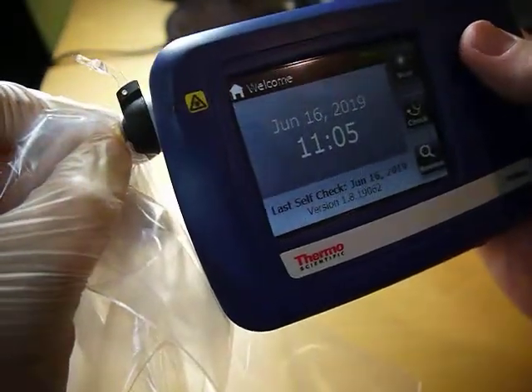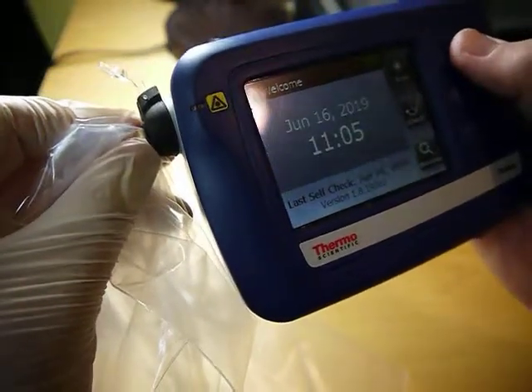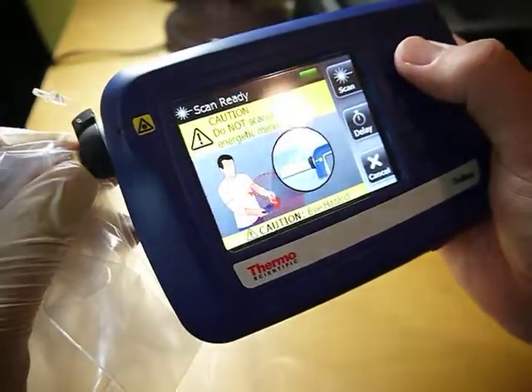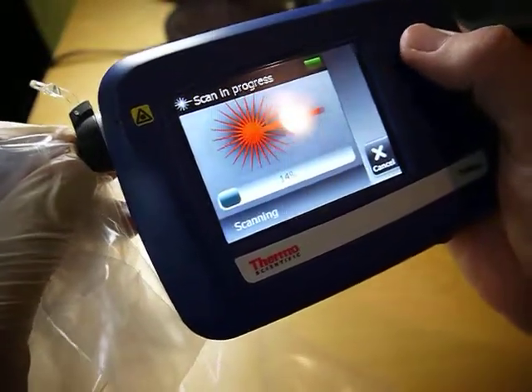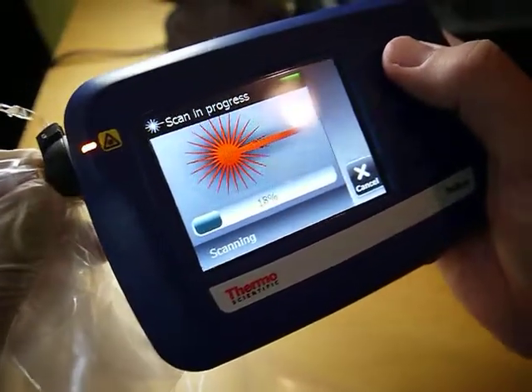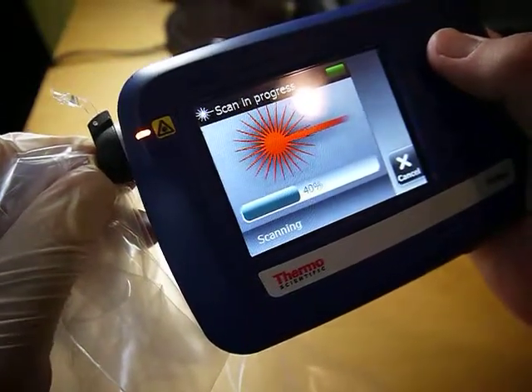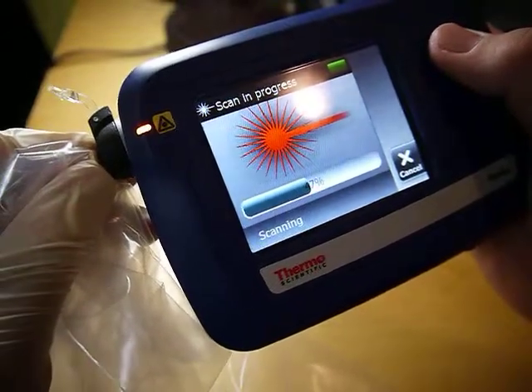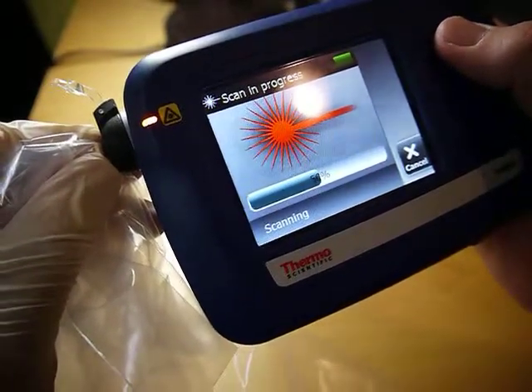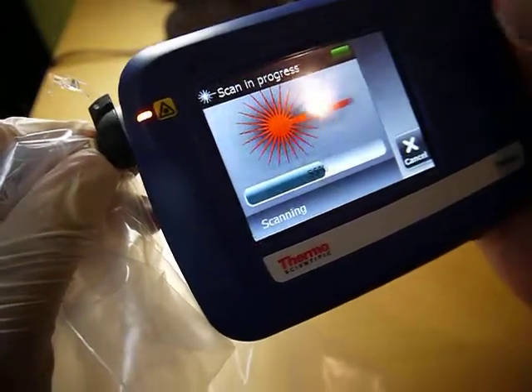In the previous video I talked about the laser — you don't want to look at it directly. And you don't want to point it at anything dark, because the laser energy will heat it up. I don't recommend it going on your skin, and you basically definitely don't want to put it on anything darker in color because it'll heat it up.